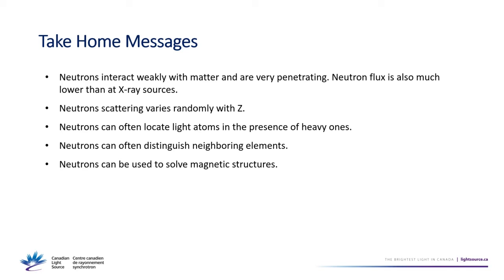So neutron time is considered a little bit more valuable than synchrotron beam time. Generally, if you could do an experiment at a synchrotron or a neutron source, you should do it at the synchrotron, and neutron beam time should be reserved for problems that really can only be solved using neutrons. So it's also important, if you're writing a neutron proposal, that you say why you have to have neutrons and why you couldn't do it using lab-based powder diffraction or a synchrotron. And there are a lot fewer neutron facilities in the world than there are synchrotrons. Governments tend to like to build synchrotrons because you get more papers per dollar out of them.